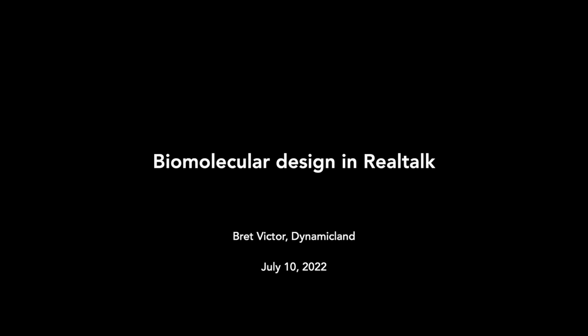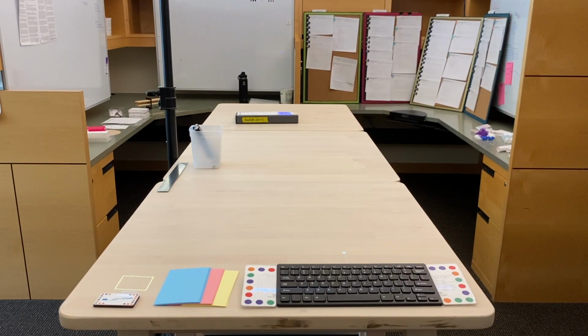I'll be showing Shawn and me going through tasks from the project that Shawn described. We'll be designing a fusion of two proteins, designing a DNA origami structure for the proteins to bind to, and making the origami in the wet lab. And this is the space where we'll be working.